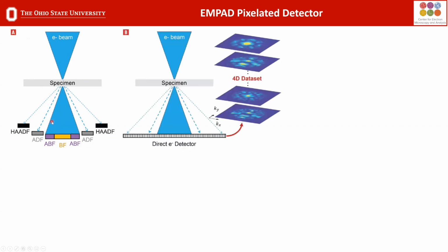But imagine if we had a direct electron detector. If you're not familiar with a direct electron detector, I'll talk just briefly about it. On these detectors, first, these are pieces of silicon, and they have very large sizes, right? On a 4-quadrant detector, there are 4 quadrants of silicon. And anything that hits that piece of silicon is read out as a charge.